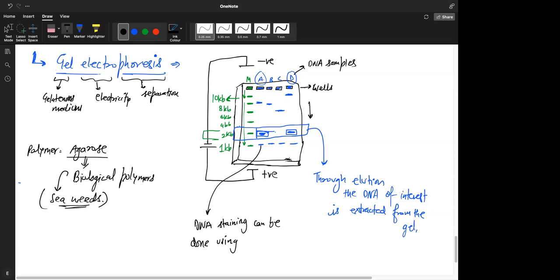This is just to visualize the DNA where our stain is, and for how long we want to run this gel. Because if you're running this gel, the DNA starts moving. Over time, you will see this last band going farther and farther. But you have to know where to stop, because if you can't see the last ladder, then it will just continue moving and come out of the gel into the liquid. It has happened to me also, where I have run the gel wrongly. I put the gel like this, but towards the well region, I by mistake connected the positive terminal. So what happened is the DNA just came out of the well and moved towards the opposite side and just jumped from the cliff into the solution, kind of.